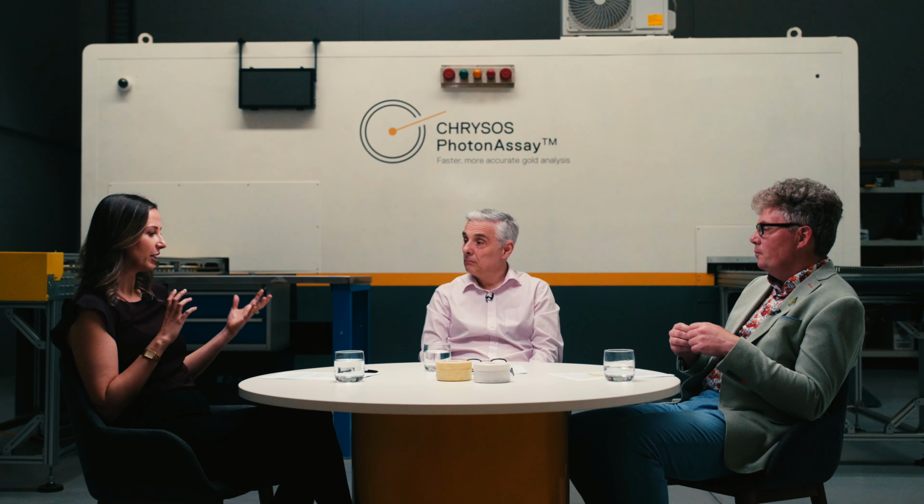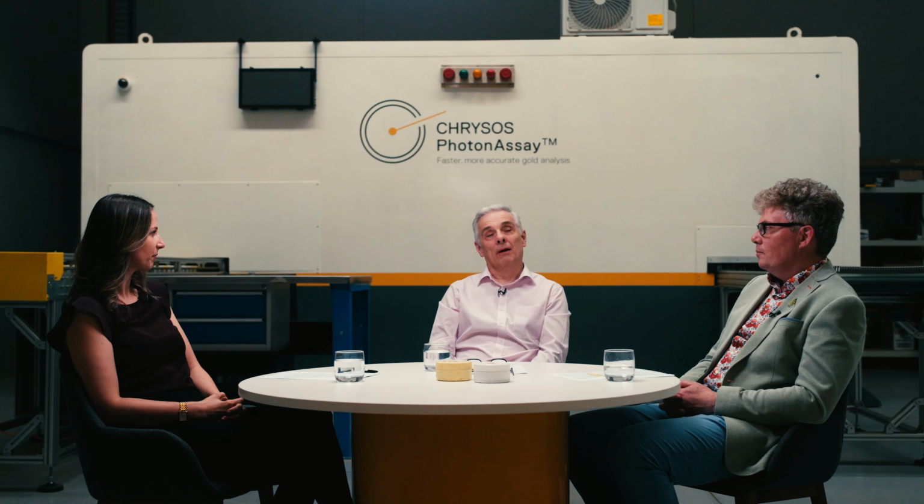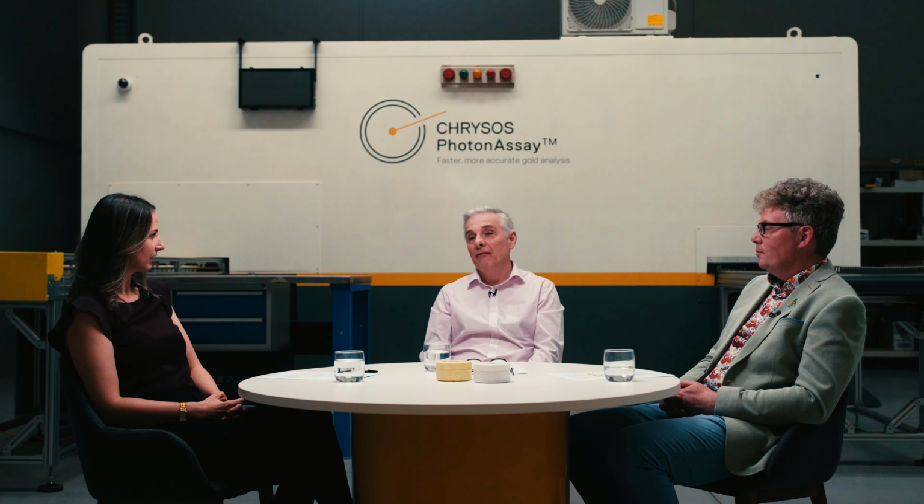And that, again, may be something that people are just not too familiar with coming from a more traditional fire assay background. When it comes to new technology, you can't just put new technology in the same spot and expect everything to line up. But obviously, understanding that, 0.1 ppm is really the limit of what you're working with most of the time. I can't think of any instances where, as long as you can get down to 0.1 securely and safely, you'd have too many issues.